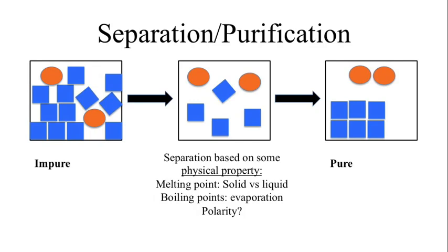The next and potentially bigger issue is that, sorry, just lost my train of thought, is that organic molecules have some heat issues, to put it mildly. Okay, think about it this way. We're made out of organic compounds. Our t-shirts, our clothes are all made out of organic compounds. What happens when we heat them up? Do we really see them turn into a liquid? Or do they melt or combust, or do they burn, combust, turn into CO2?